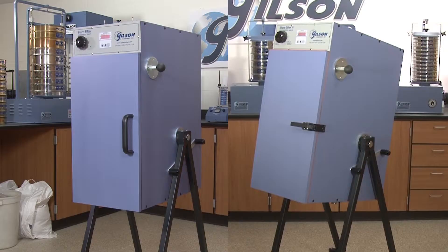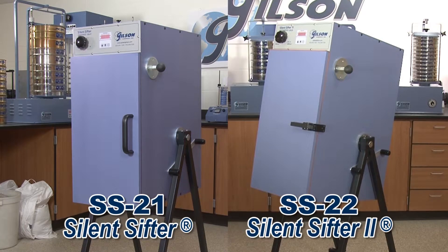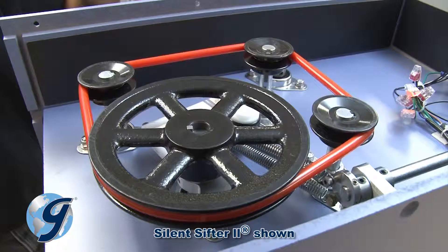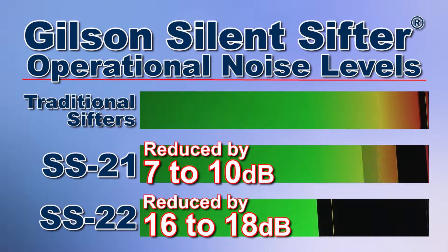The Gilson SS21 silent sifter and the ultra-quiet SS22 silent sifter 2 have advanced proprietary silencing technology that includes a specially engineered sound-abating tapping mechanism that significantly reduces operational noise levels compared to standard rotary sifters.